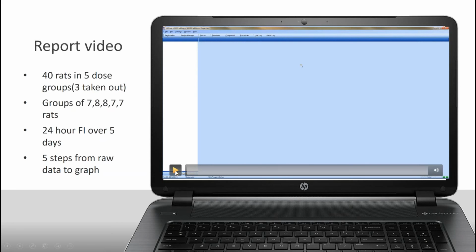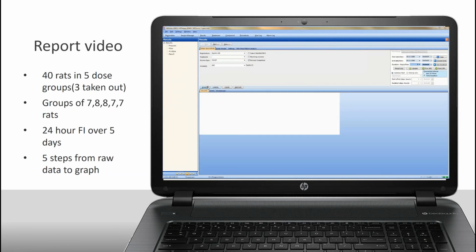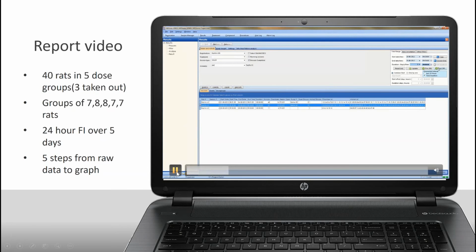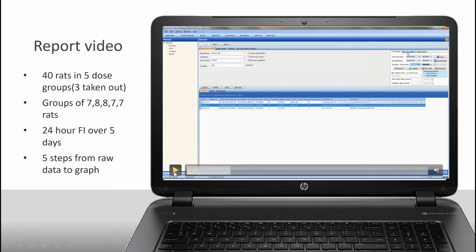This is a video clip, so I will try to pause the video and comment on the different settings as we are running through it. Firstly, we need to select the experiment, the study, and the session you want to extract data from. Hopefully you have a big screen because the text isn't that big. Now we have the session selected. Now we need to select the time slot and duration, so this is done over here. I won't go into details at this point, but it was just to show you how quickly and how easily we can do this.